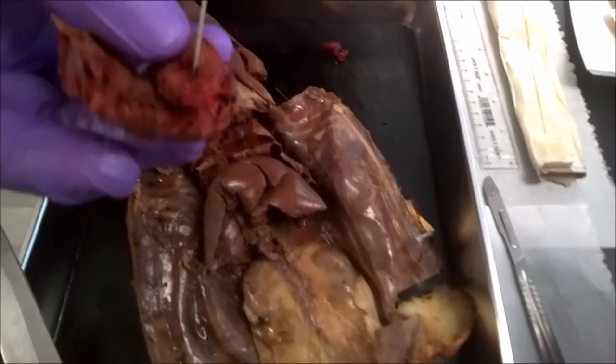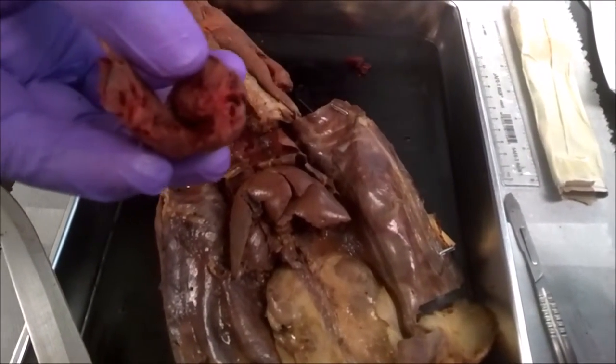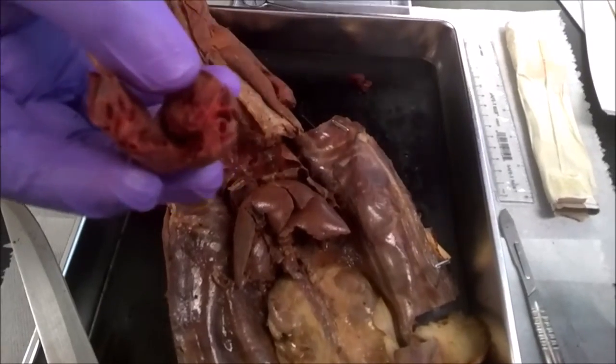Unfortunately we can't see the semilunar — a little bit too small right now — but that's the one that separates out, going out through the whole body or over to your lungs with the blood going through.